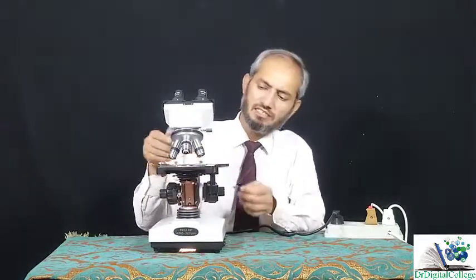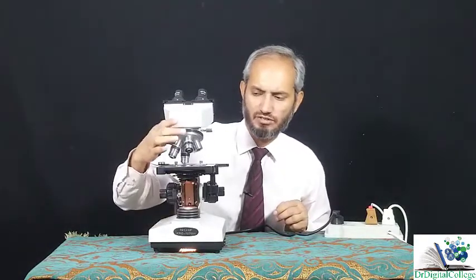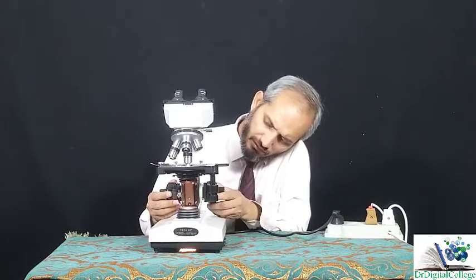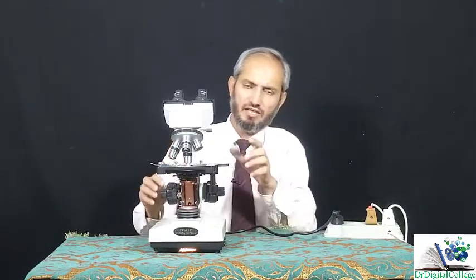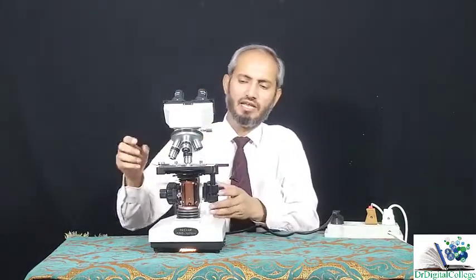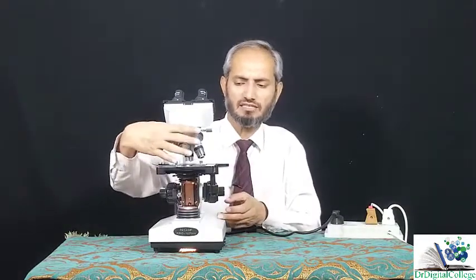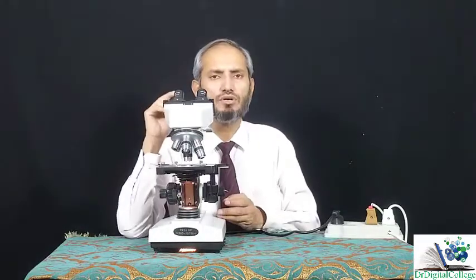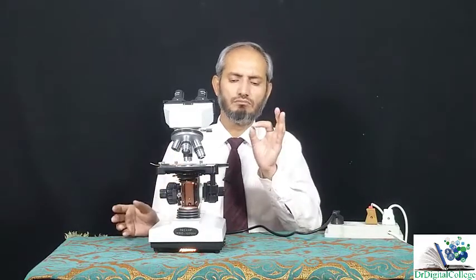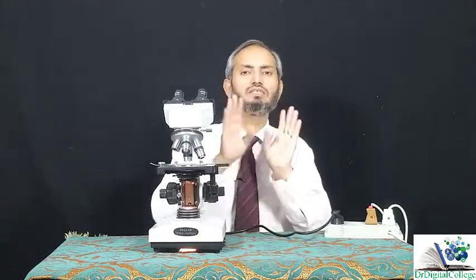I mean to say, adjust the minimum distance between the largest magnification and your object like this. I'm doing it once again: I have maintained this minimum distance between my objective lens of the largest magnification and this slide by directly observing it. And then I have changed to whatever magnification I want to use. Red, this is 4x, or let it be this one, 10x, or whatever. And then when you observe through your eyepiece lens, your object will be focused. You may need to change the position to locate your object, but it is focused.